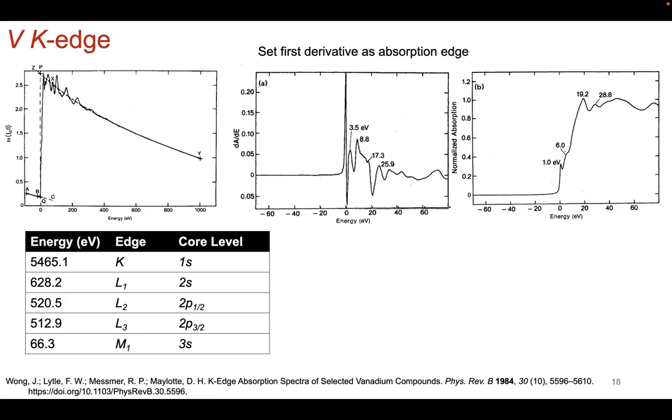But if you see in the literature, the white line energy, it's different semantics, but same idea. Okay, so what you can do from all this signal is quantitatively define what exactly your absorption energy is. You just take the first derivative and the inflection point will be set at whatever energy you're at here. This is 0 beyond the absorption energy.